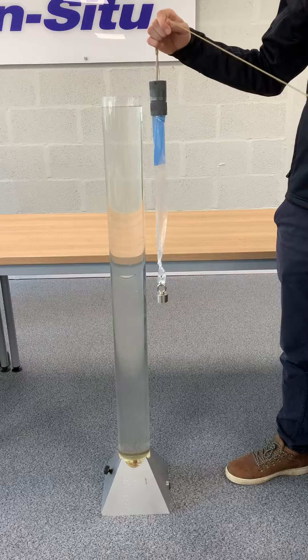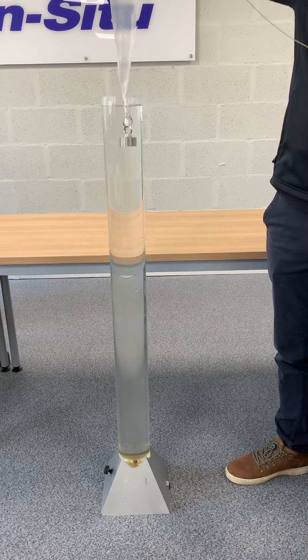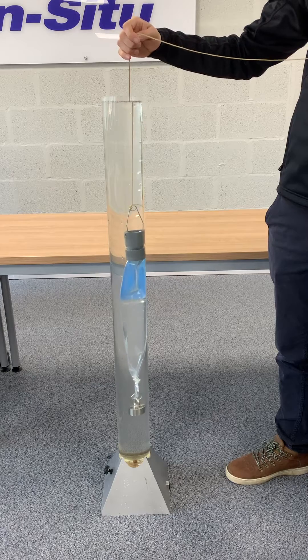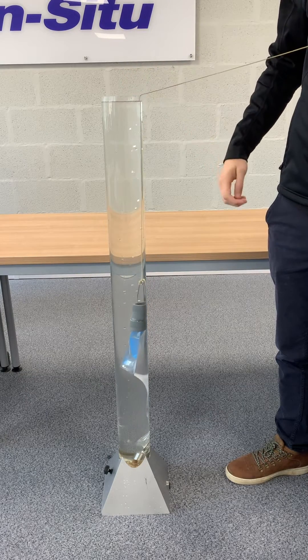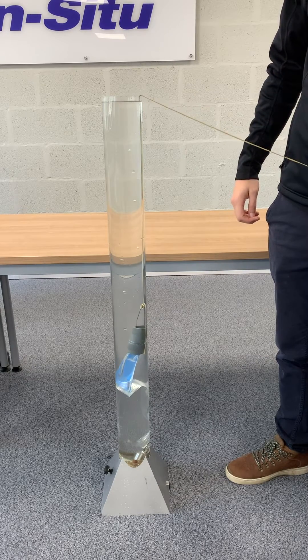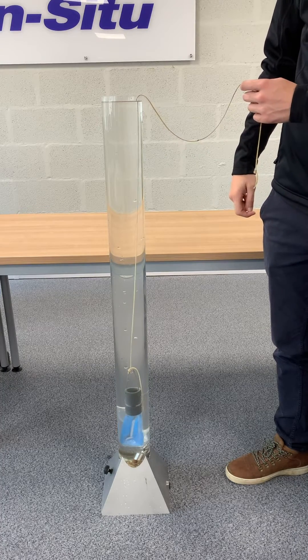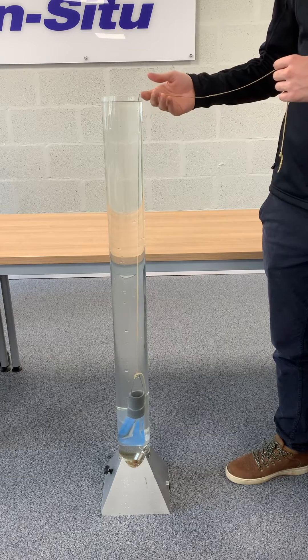You can use this sampler to take a sample from any depth you like. You'll lower the sampler into the water column with the opening of the sampler just below where you want to take your sample from. After settlement time, pull the sampler out in one short sharp motion. This will activate the valve and the sampler will fill up over one and a half times its length.